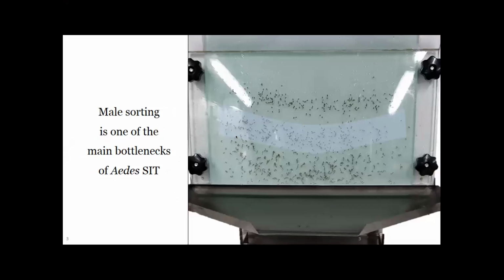And currently, one of the main bottlenecks is the sex separation that is operated at the pupal stage using mechanical methods such as metal sieves or glass plates, as you can see here. These methods are very error prone and have a low recovery rate. So that's the main thing we wanted to improve in our project.